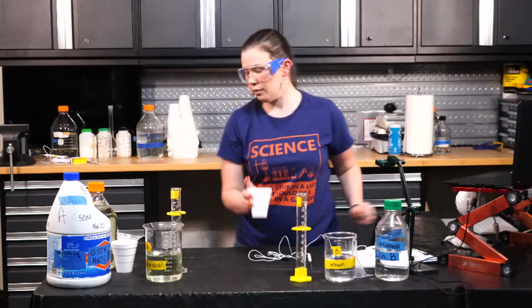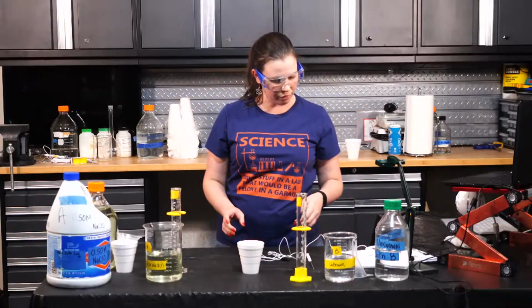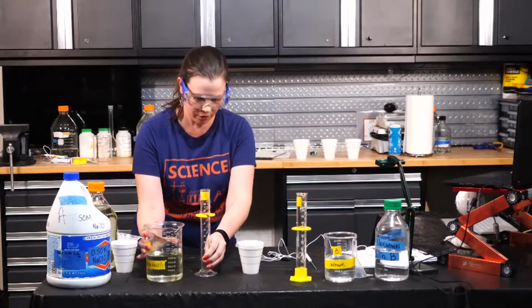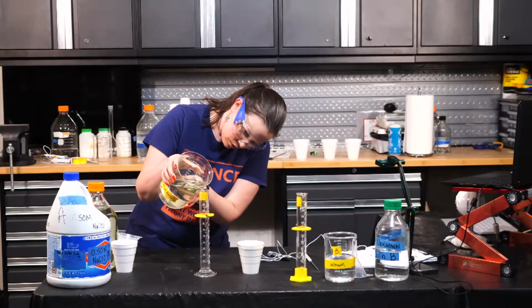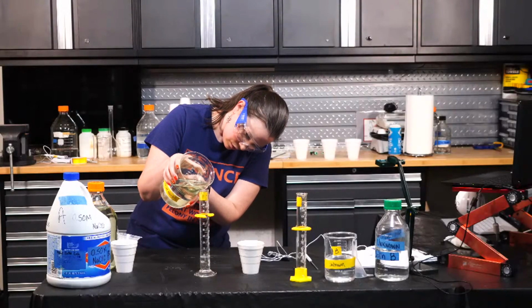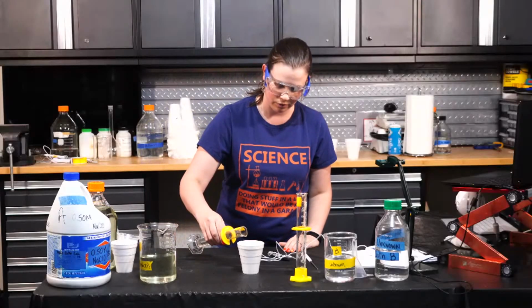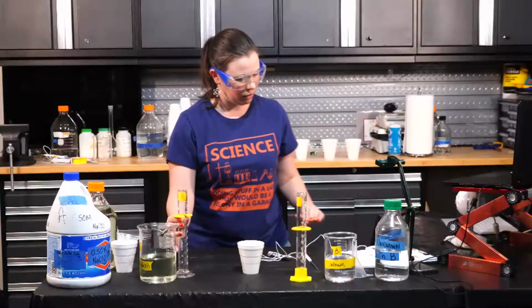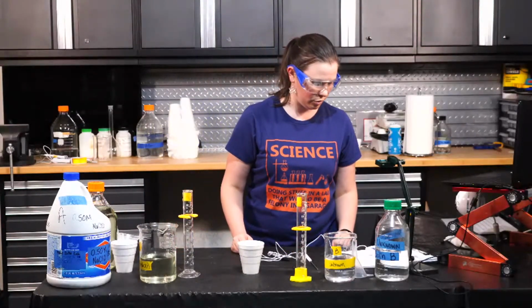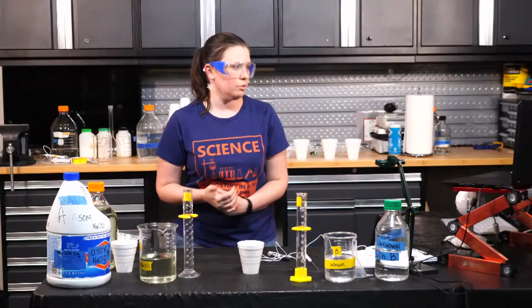All right, new cup. Now for level 5, we're doing 45 milliliters of bleach. So we'll go ahead and put our bleach in the cup. And then only 5 milliliters of solution B. So I think I've hit the point where I've got to go grab that graduated cylinder. So it'll take me just a second to run to my room. I'll be right back.